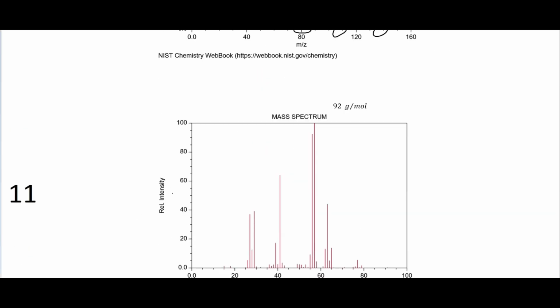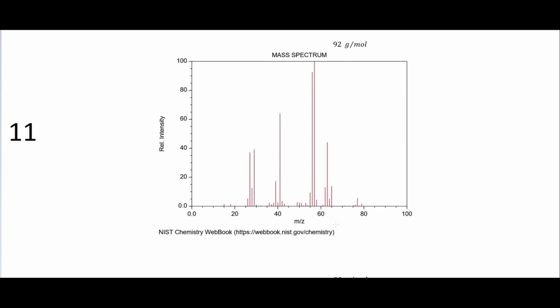And so if we go down to the next one here, what we see is now we have these peaks right here. And we see that we actually don't have an M plus showing up on here because that M plus, well, it's probably hard for you to see, but there is a very tiny red peak right there. It's like maybe just a couple pixels large. But it might be difficult to see, so we might just call this as not having an M plus peak.